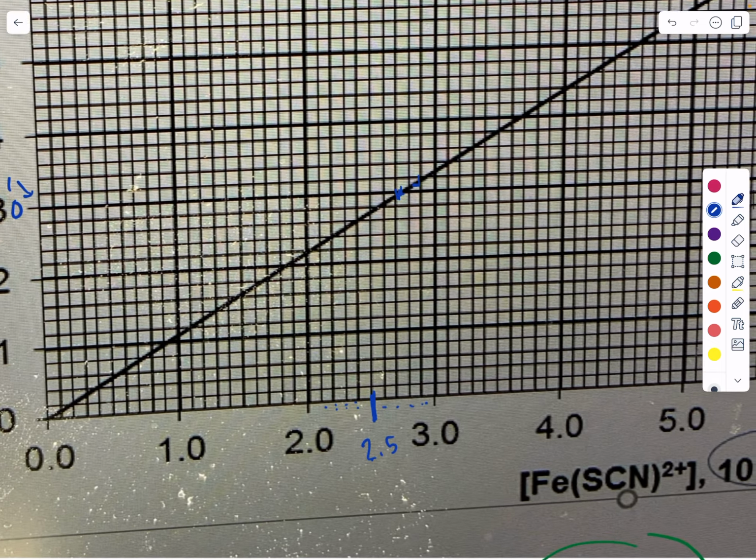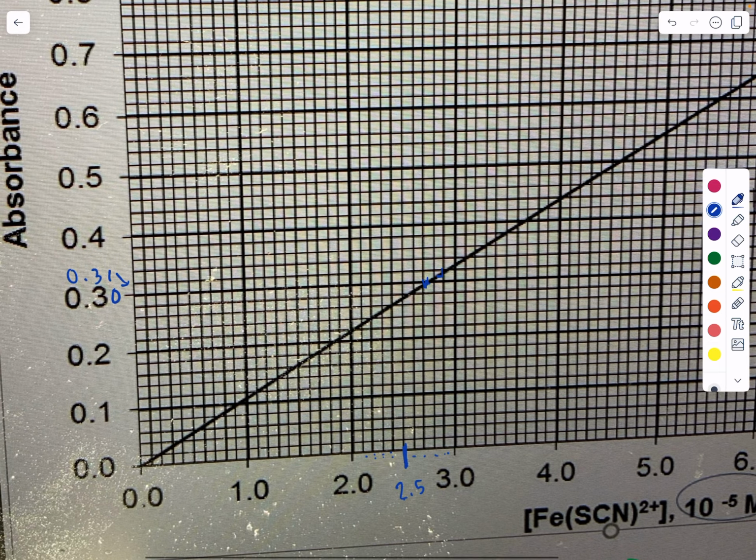If you look right in here on this chart, it was 0.307. These actually go up by 0.02, so that's actually 0.32. So 0.307 might be a little bit less than half of there. For the moment, I'm going to mark it as though it's 0.30, and we'll just scale it up a smidgen.